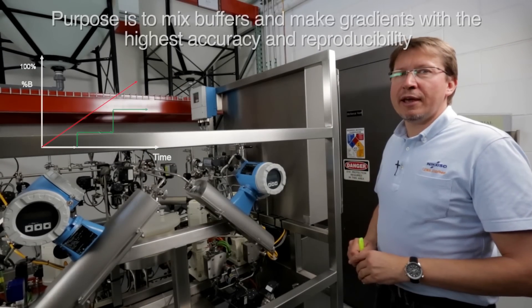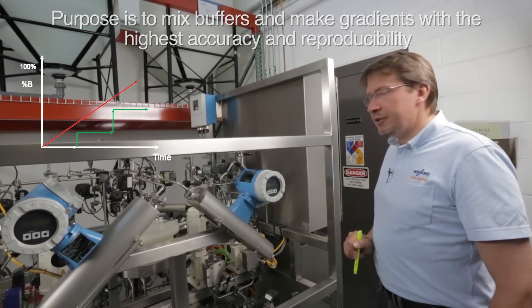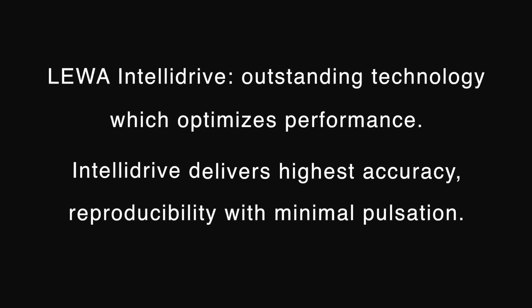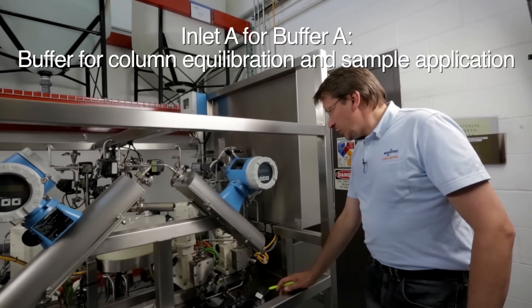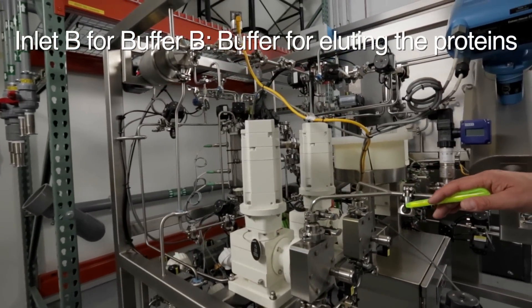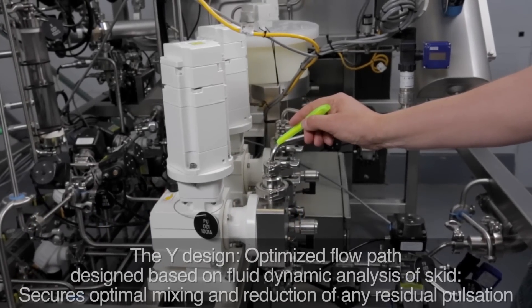One purpose of LEWA EcoPrime is to mix buffer to create gradients. In order to do this with the highest accuracy, LEWA EcoPrime employs LEWA Intellidrive pumps. The system has two channels: Inlet A on channel A to pump buffer A into the system, and Inlet B with pump B to pump buffer B into the system.